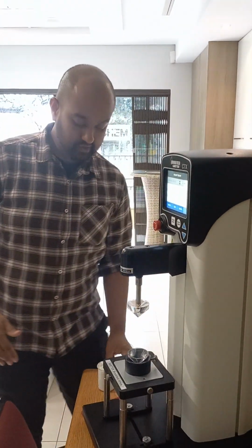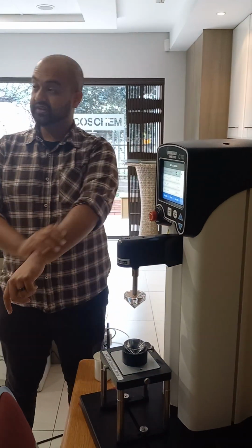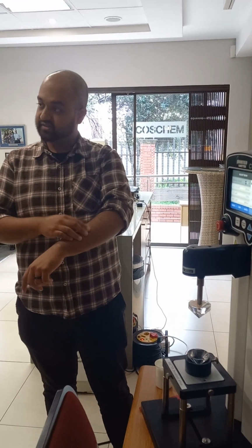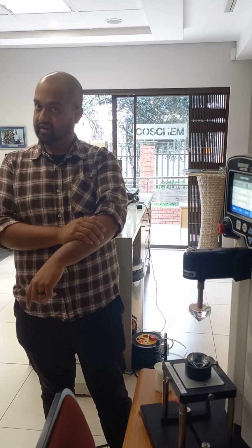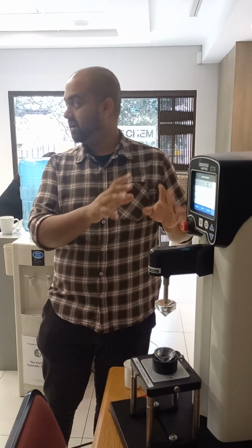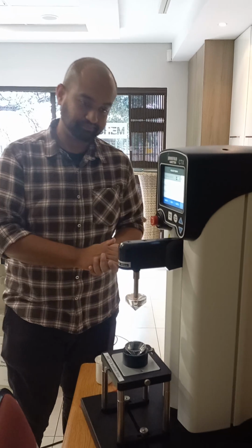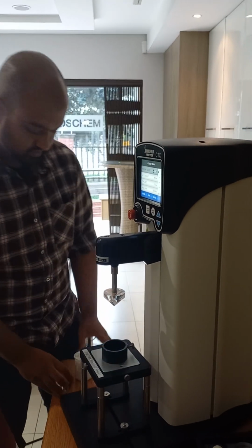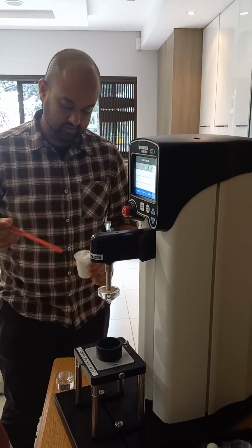So you're looking here at spreadability, how easy it is to spread it on your skin, and the adhesiveness, the stickiness of it. This can actually give you a quantifiable value for that. Right, so let's add some sunscreen to this.